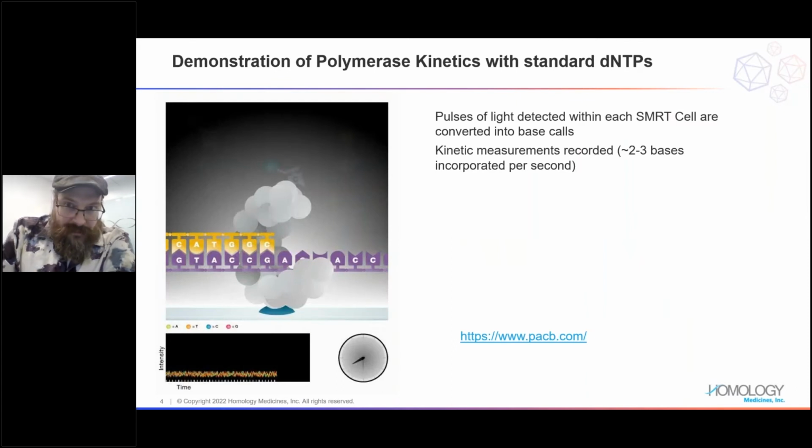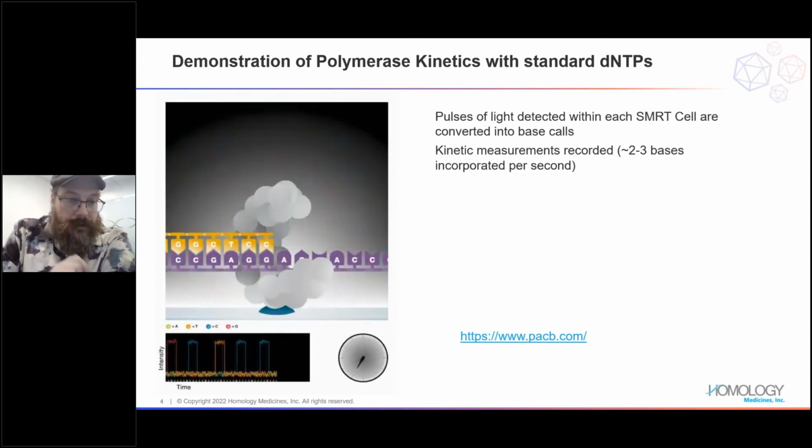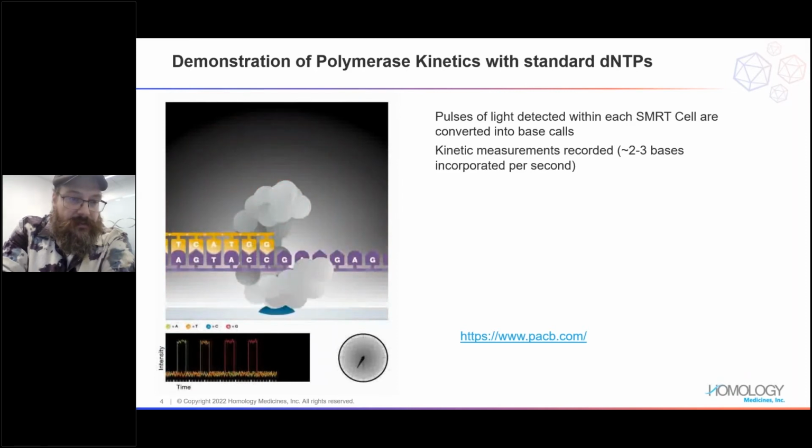So again, this is just to demonstrate how the system works. You've got a camera, you're looking at a polymerase, which is represented by the little blob, and here you get these flashes of light as it's incorporating the nucleotides, right? And then the little darker screen at the bottom is essentially to give you the idea of the observation of the actual movement of the enzyme over time. What's going on? How's it incorporating its bases, and how's it working?